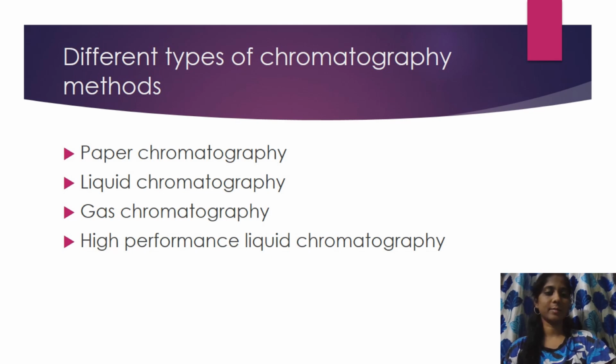Different types of chromatography methods: the first is paper chromatography, the second is liquid chromatography, the third is gas chromatography, and the last one is high performance liquid chromatography.